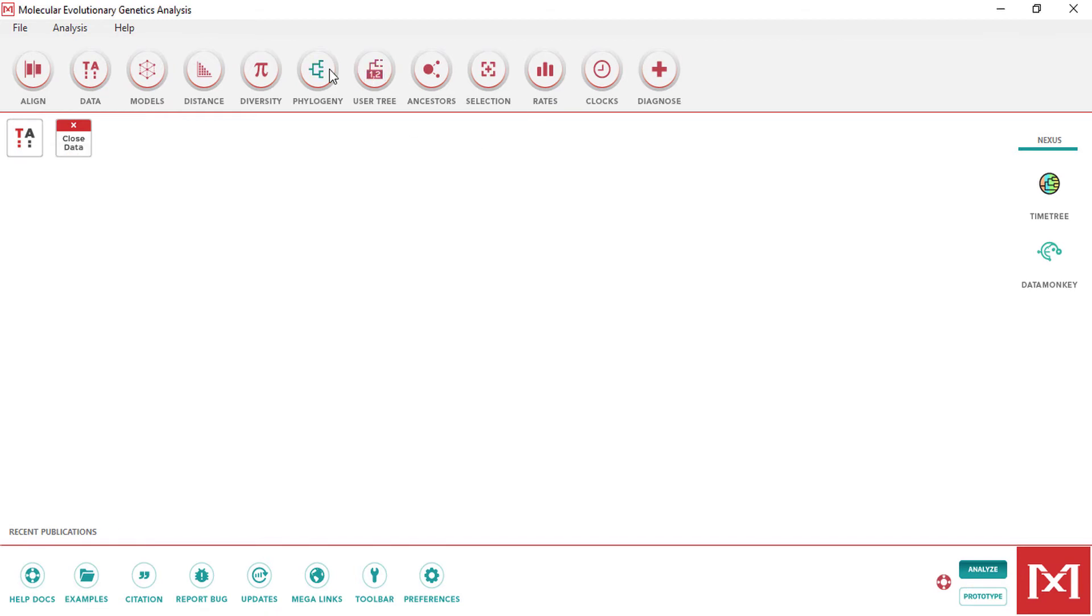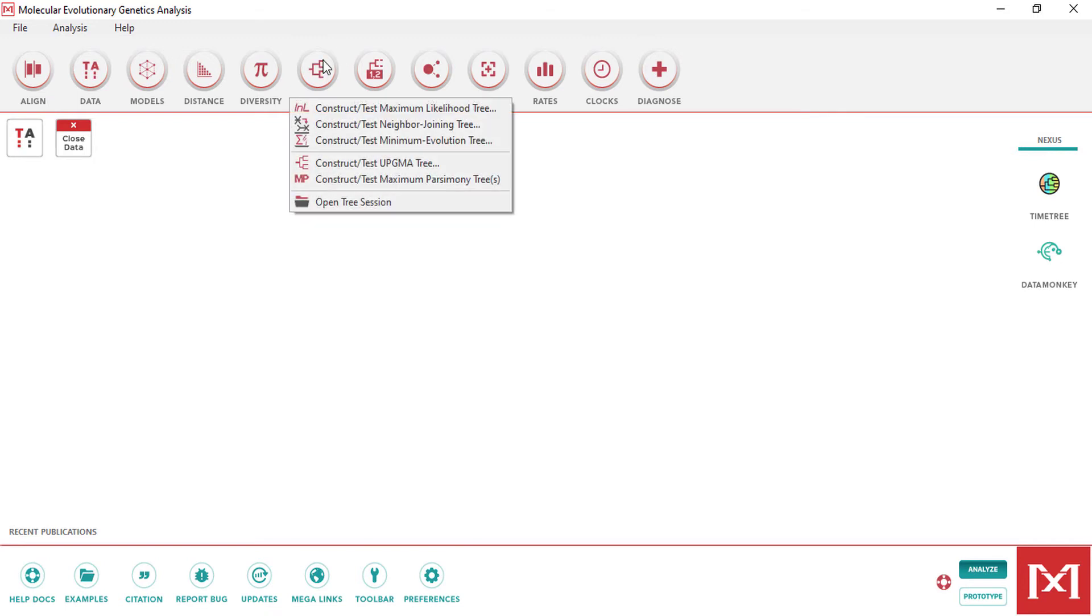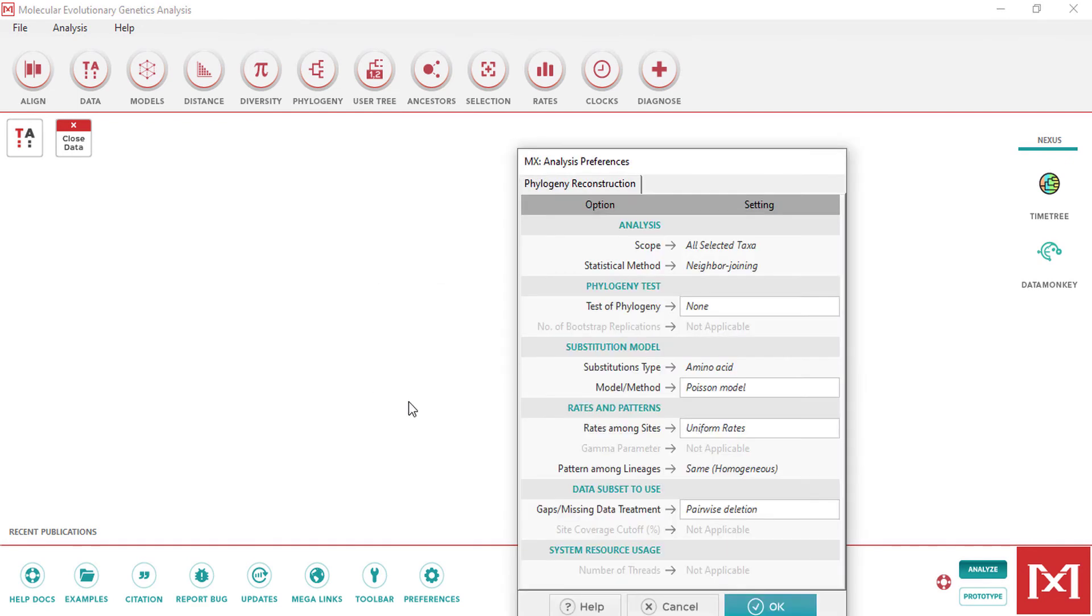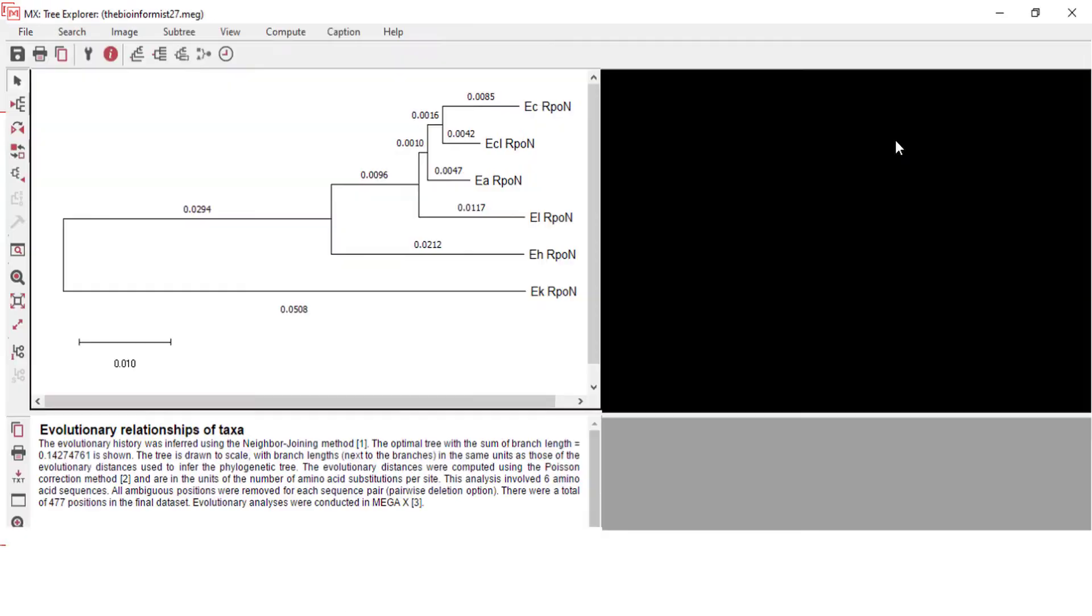Here we can construct a phylogenetic tree by clicking on phylogeny and selecting the required tree algorithm: construct maximum likelihood, neighbor joining tree, UPGMA. These are all phylogenetic tree algorithms. One of the most popular reconstruction methods I am using is neighbor joining tree. Yes, I want to use the currently active data, which is the mega file. Okay, the phylogenetic tree is constructed.